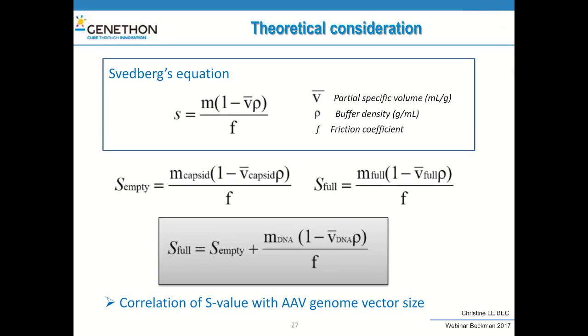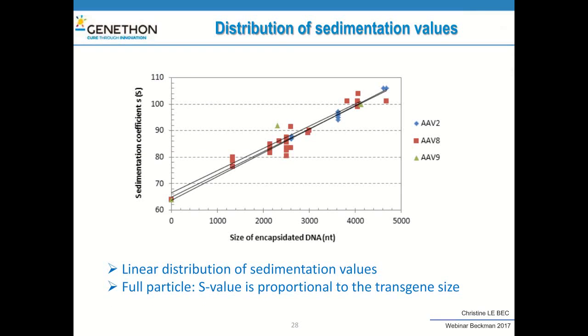This is the theory, and we demonstrated it by running different products and preparations with different sizes of encapsulated DNA. On this slide, we show the sedimentation coefficient as a function of the size of the DNA for AAV2, AAV8, and AAV9 in blue, red, and green.